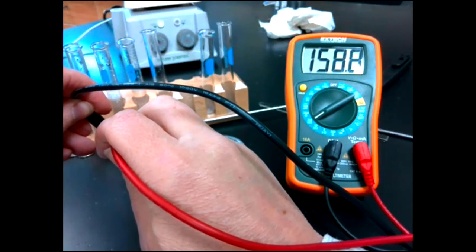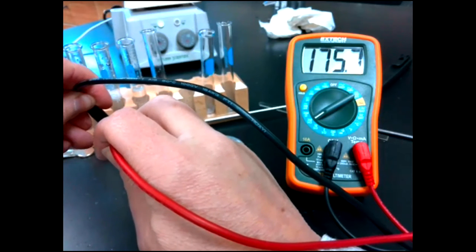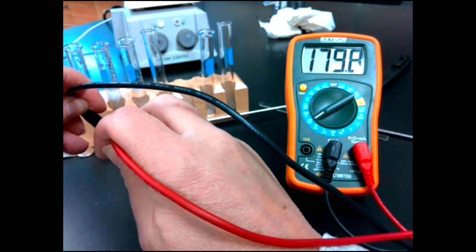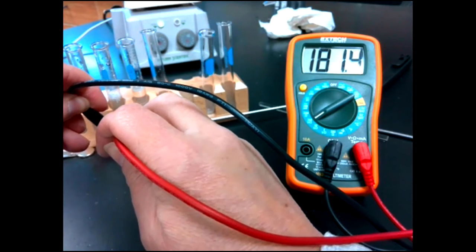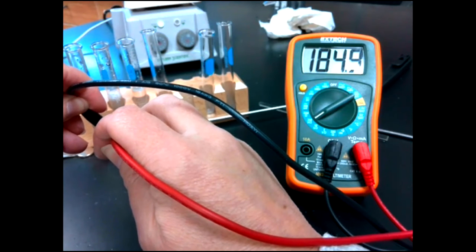Okay, so they're flashing and they're not 1, which means yes, it's conducting. Not as well as metal, but that's normal. I wouldn't expect it to, but it's definitely conducting electricity. So this is A in water.